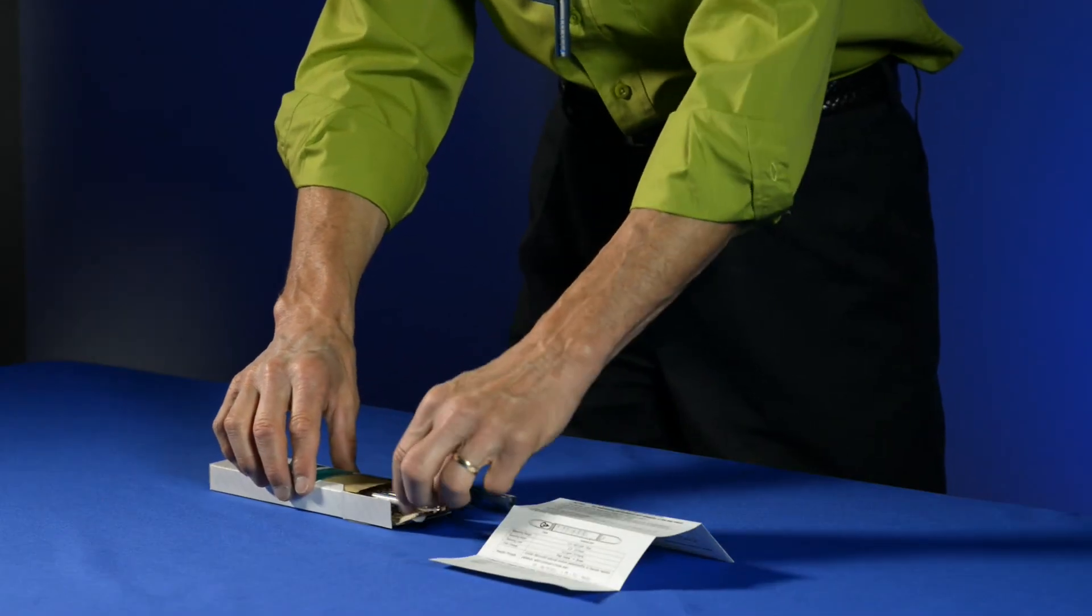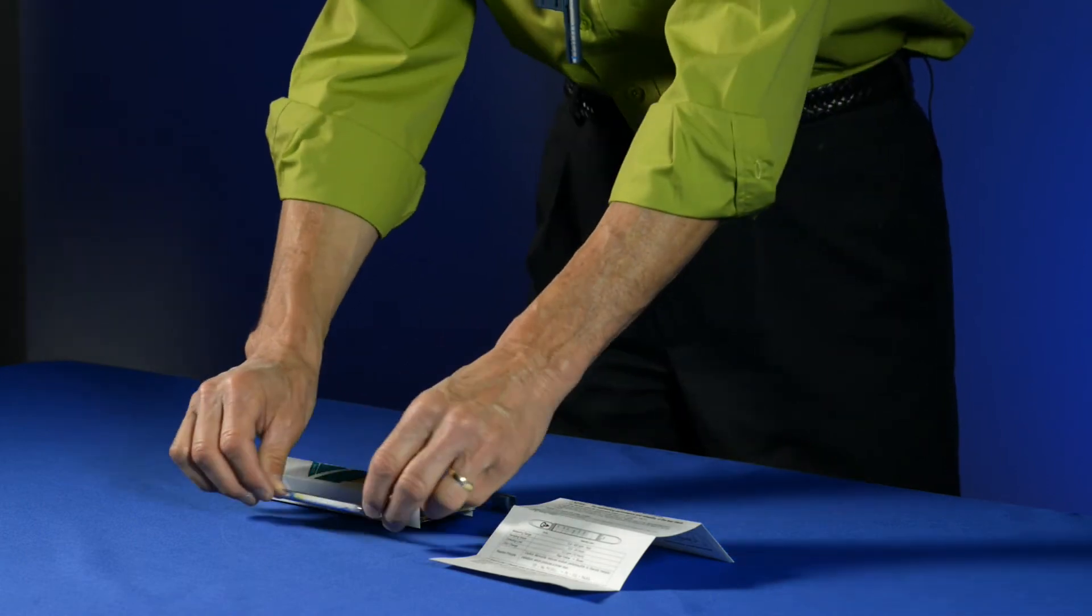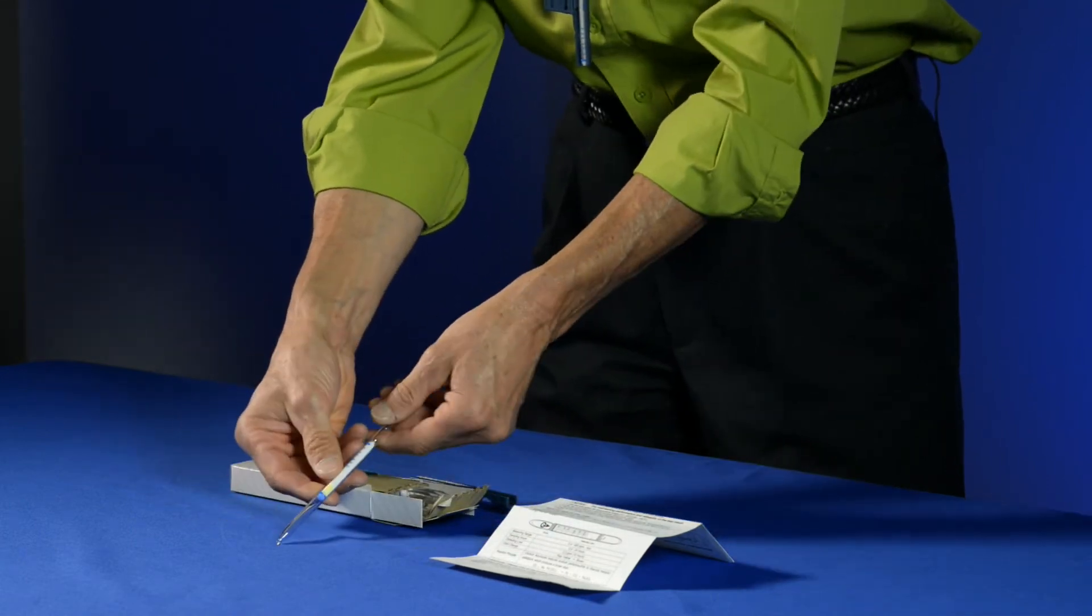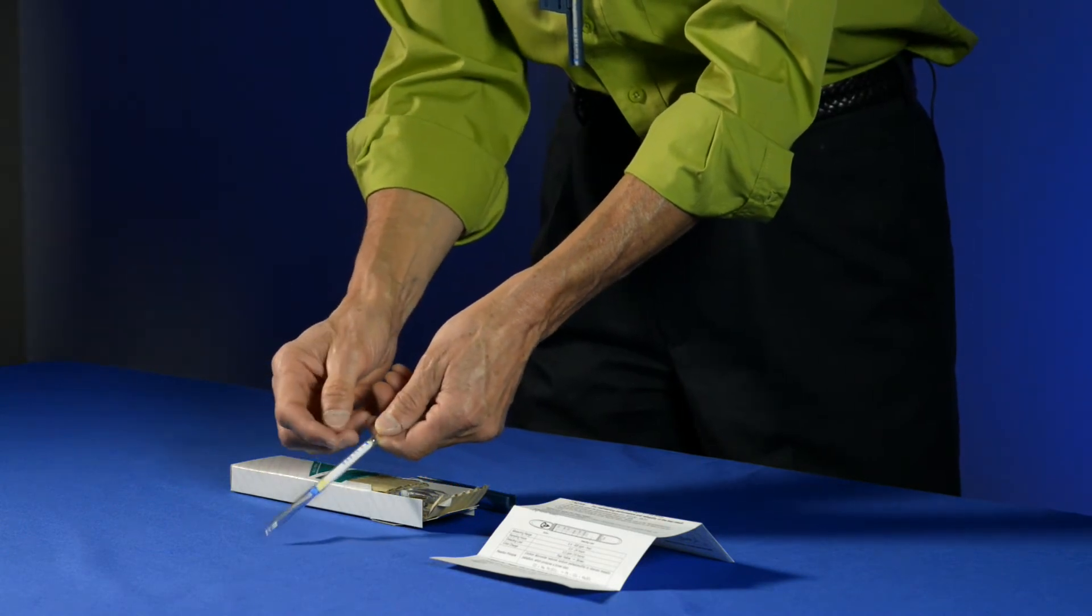Tubes themselves, that's the detector tube there. So it's a long, narrow glass pencil. And you can see it has calibration marks. So it's pre-calibrated on here.